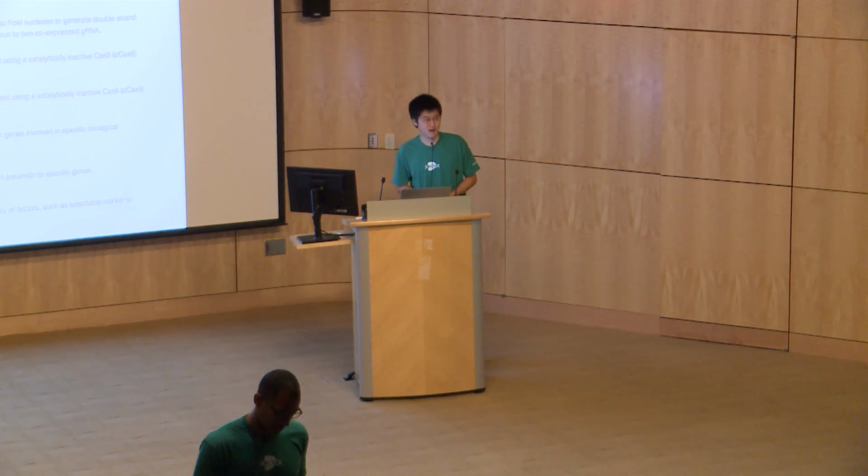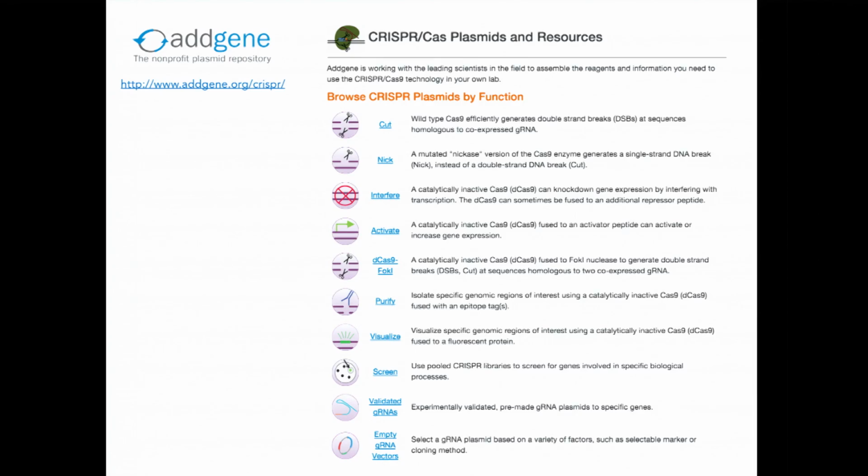Thanks, David. My name is Lin Yi. I'm also a graduate student in the Zhang Lab. There are many great resources on Addgene for CRISPR plasmids, anywhere from cutting and nicking, down to screening and visualizing. And there's a great compilation of many plasmids that have been deposited by many labs around the world that have been really useful to us and broadly useful. I encourage you to visit this page if you haven't already to find the vector that might be the best for your experiment.